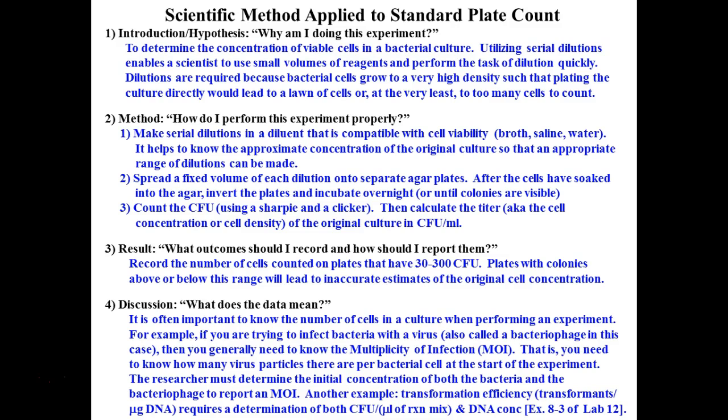But we do have a quiz on this next week. And Kirby-Bauer. Kirby-Bauer is a walk in the park, right? It's going to be just like the homework problem that you had. I'm going to tell you the measurements. I'm going to give you the chart. You tell me whether it's susceptible or resistant and what antibiotic you would give your patient, right? And what's important about that test, right?